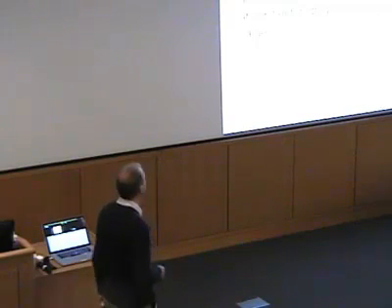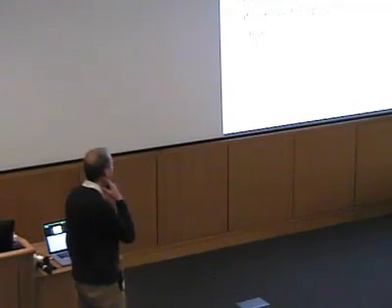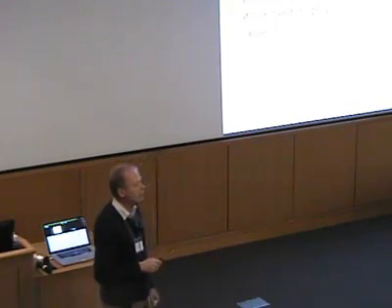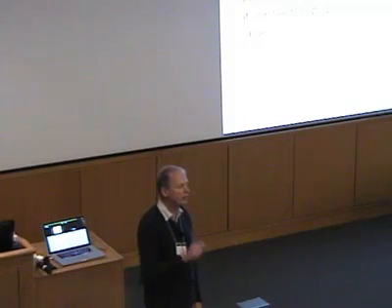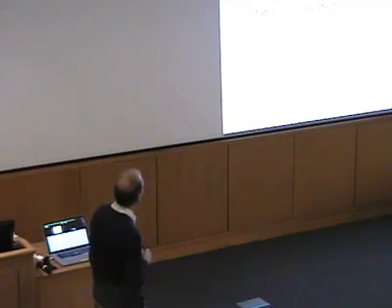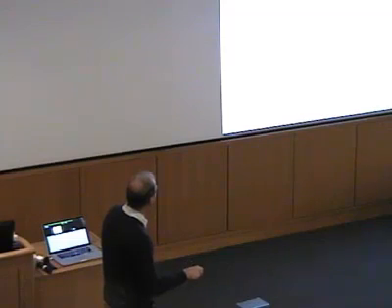Okay, but because people here are interested in bioinorganic systems, we should also touch briefly on what happens with metals which have high spin. Here, if we have a high spin system, usually the zero field splitting is much, much stronger than the interaction with the magnetic field. Right? So unlike our triplet, which I just showed you a minute ago, where we have this relatively small splitting, and then when I apply my magnetic field, I have my three levels well separated and so on, the main interaction is the one with the field, and the zero field interaction is a small perturbation on it.